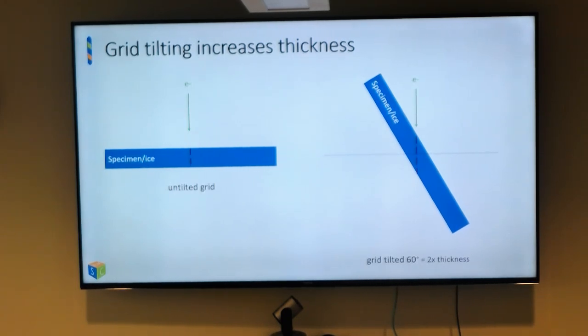So what kind of collection schemes do you think are the best ways to collect tilt series? There's only a few ways that I can think of, but what do you guys think? Like, you have to tilt your stage. There's like 3 ways. One of them is you go back and forth, like go to -3, go to 3, -6 and 6. Another one is going through -3 all the way to -60, then going back to 60. Good, good. You can also just start at -60 and go all the way. Which do you think is the best? Going back and forth?